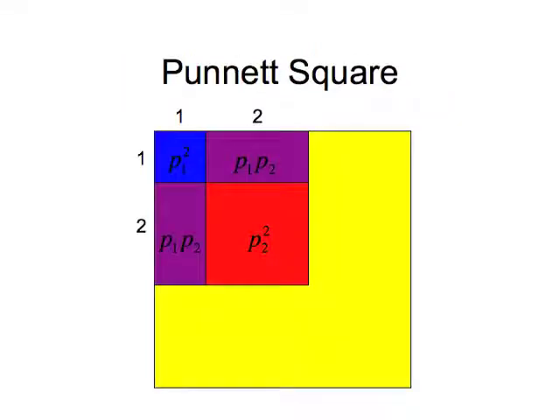Next slide. Let's focus as a simple example on a case where there would only be 2 alleles that were detected, and we're trying to understand how to infer genotypes, which are probability distributions of allele pairs, from such data. We begin by looking at what occurs in the population.